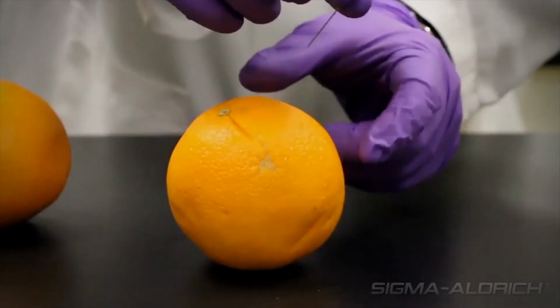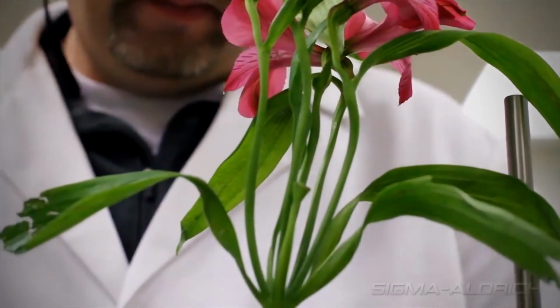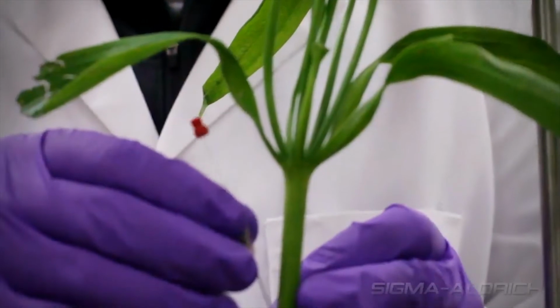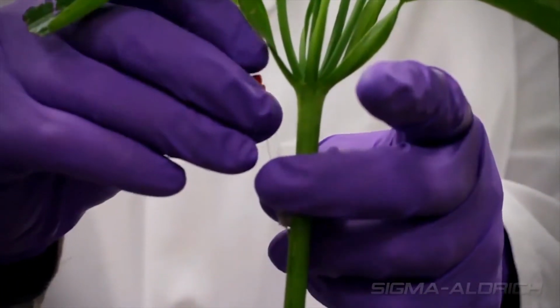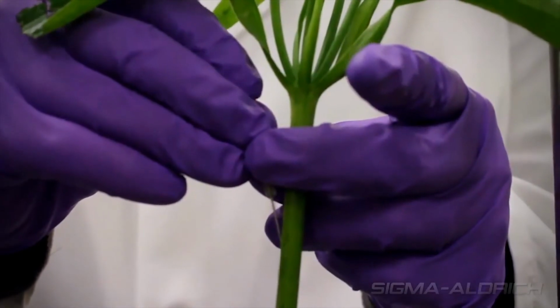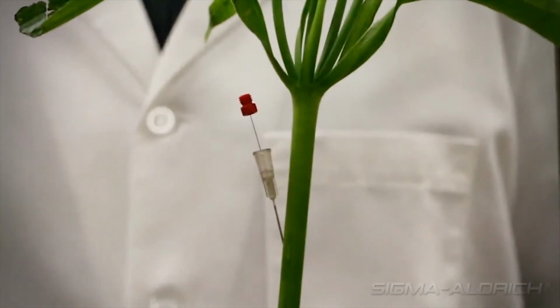the laboratory for testing. For plant sampling, the process would be to take a small core sample out so we could place the fiber into it. We would then expose the SPME fiber to the porous section of the plant so we can concentrate our analytes, remove the fiber, and then send that back to the laboratory for desorption and testing.